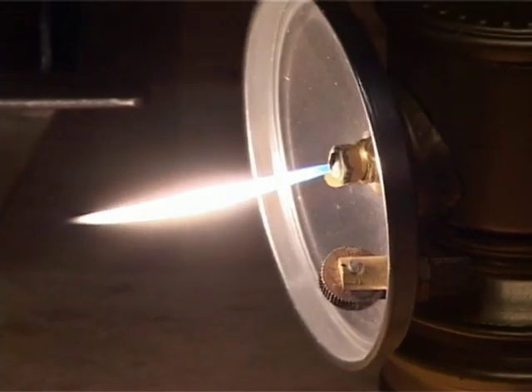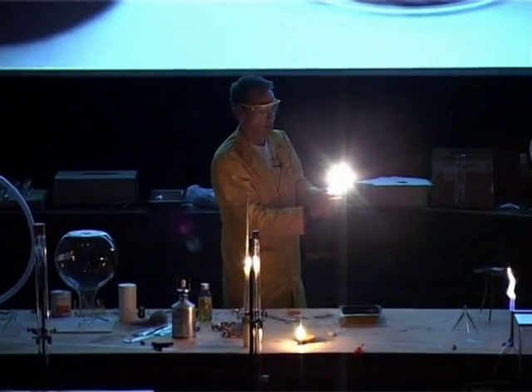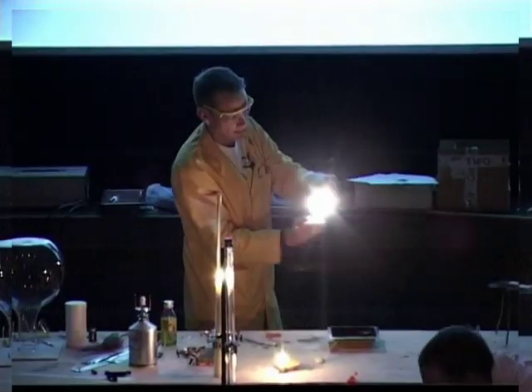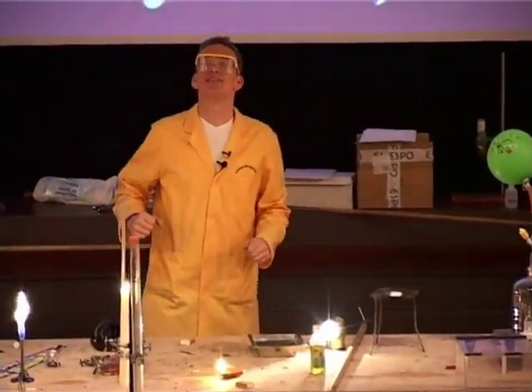So this very fine jet here is getting a chance to mix with the air around here now. We haven't got a big load of the gas there, just a very fine jet. We get a very white coloured flame there. So we've still got the particles of soot, and they're still being heated up by the energy given out of the reaction. The soot is still coming down. We're still getting black snow coming down from the ceiling.